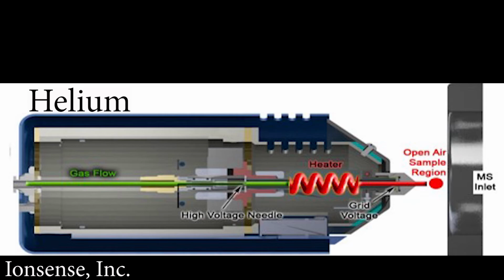There are several forensic chemistry labs now that use this for drugs routinely in their casework. I really like DART. I do collaborations with the company that sells the DART source. But DART is a terrible name. It's a good commercial name, but direct analysis in real time, you may hopefully have noticed that the rest of these names actually have something to do with the science.